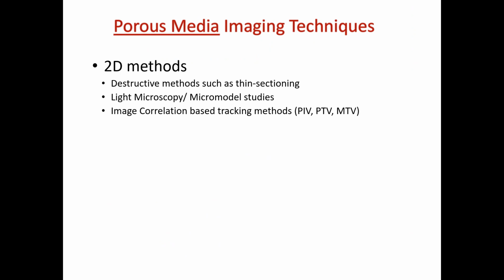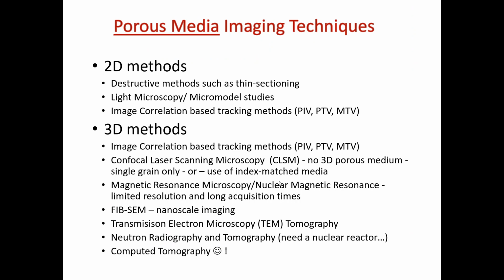So basically, we will get to that. This is for velocimetry. If I had something moving within the micromodel, I could put little objects in. They're not going to be glass spheres, but fluorescing elements that I can then track within my micromodel. As it moves through, I image again, and the difference between the two gives me how much they have moved, and I can measure velocity. So those are velocimetry methods.